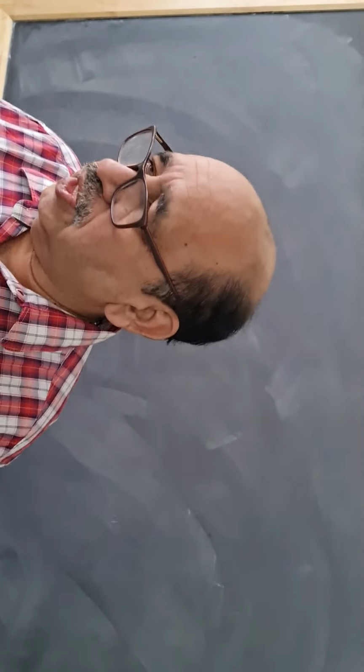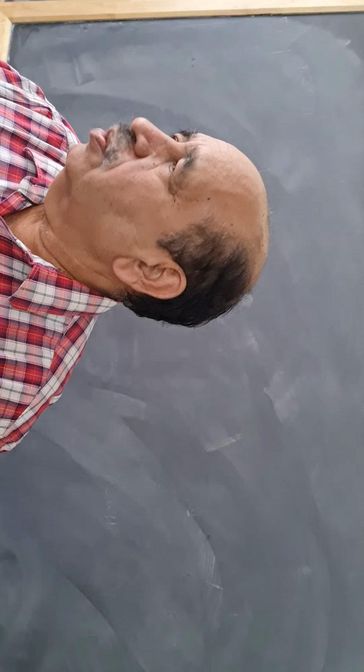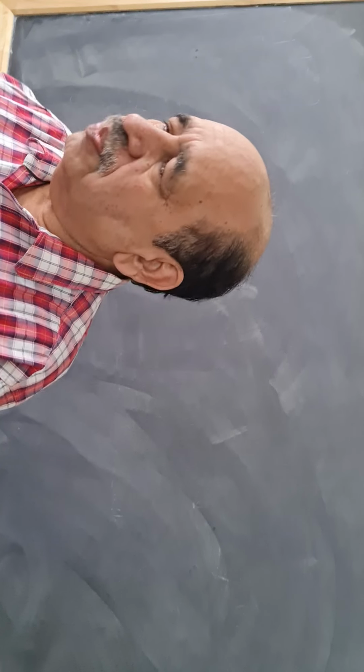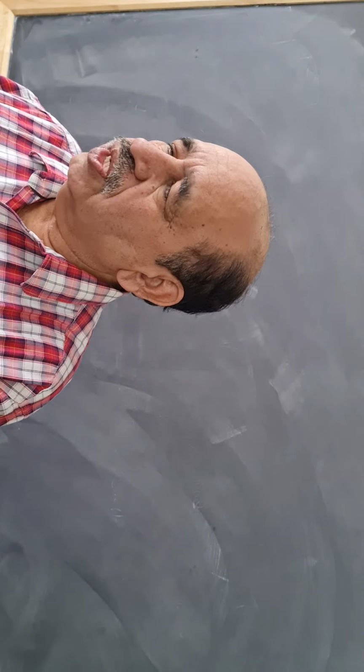Today we are going to do Ziehl-Neelsen staining. Okay, one of the important stainings that will be given in your practical examination: Gram staining and Ziehl-Neelsen staining. What are the steps, the procedure of Gram staining? Gram staining, what is the procedure?